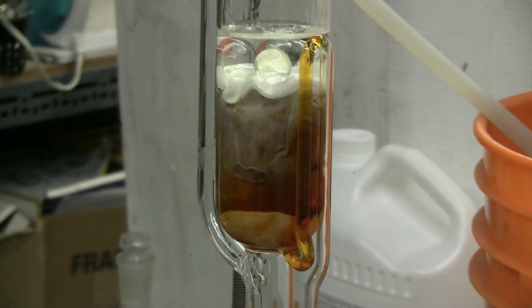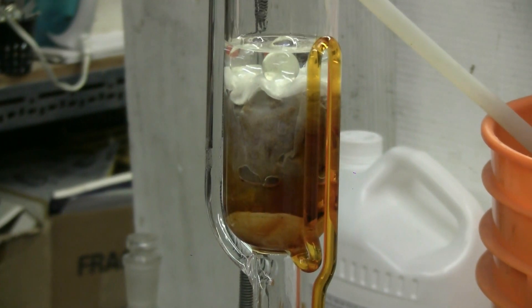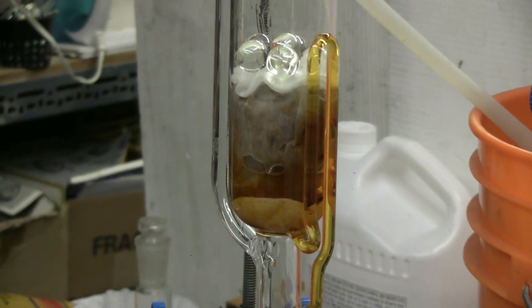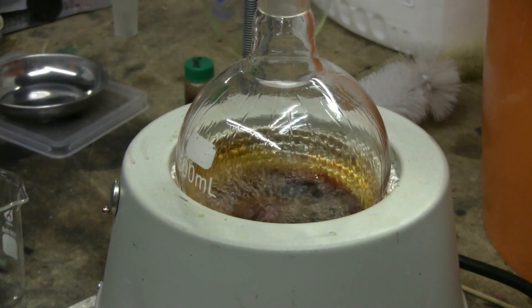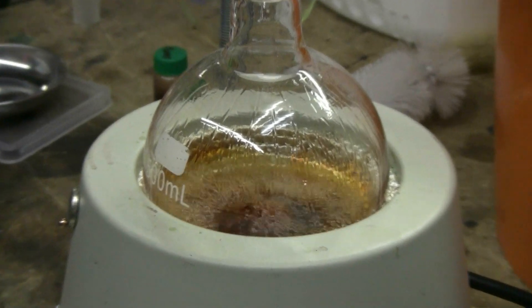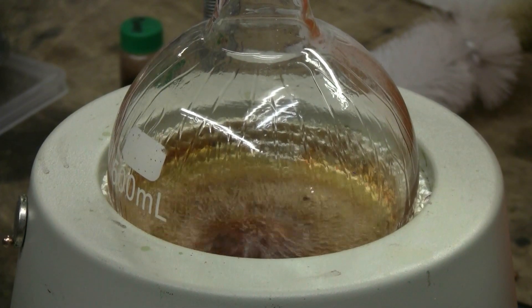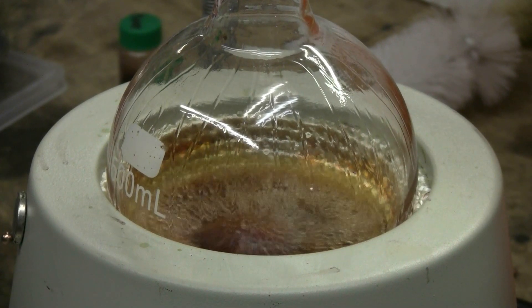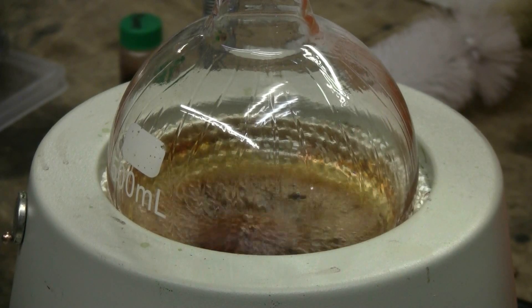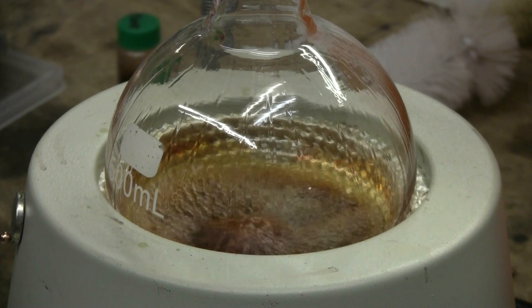This is cycle number 35. There, it's now siphoning. As we can see in the boiling flask, we have a nice dark colored extract. For time reasons, I'm going to stop here at cycle number 35 and switch over to simple distillation to recover the bulk of my ethanol.